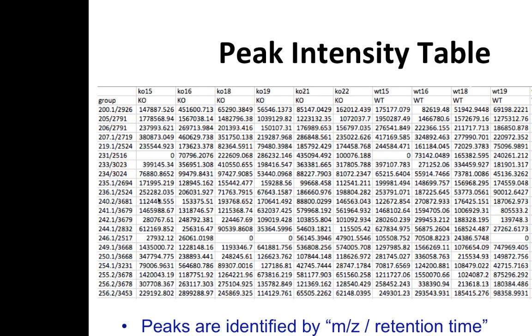So again, this is visualized, it's on the slide. This is what you get, and this one is for statistical analysis. The first row is a label for the different samples, and then each row is a peak. You have m/z and retention time. At this moment, this is suitable for a lot of statistical analysis.